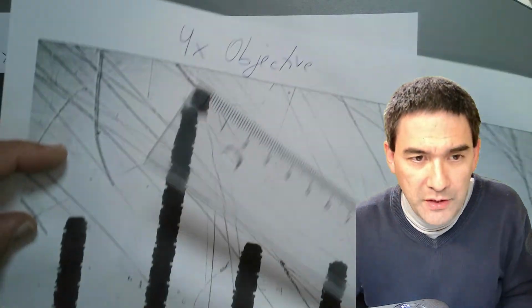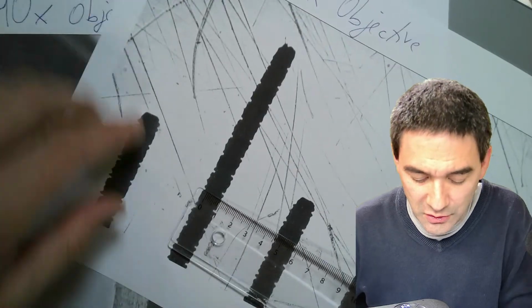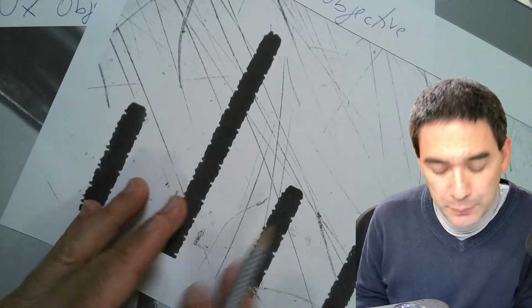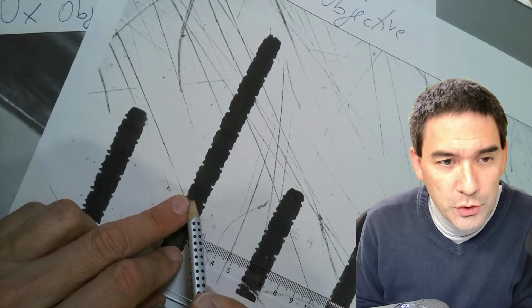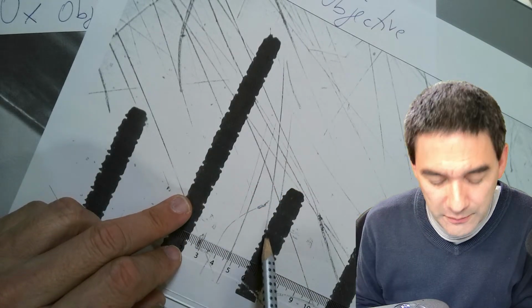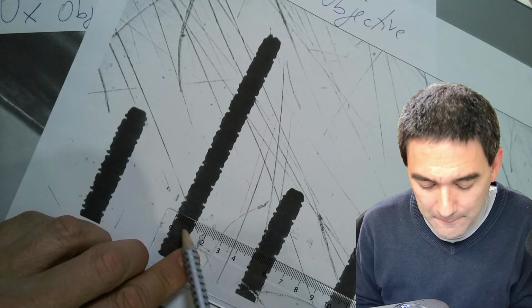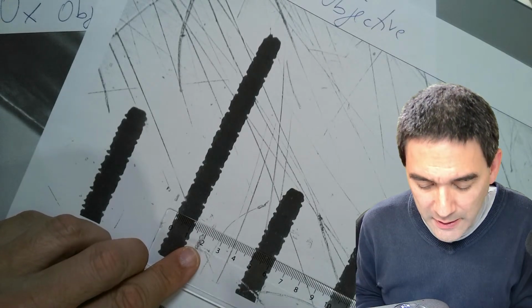And then over here, I do the following. Now the 5.3 can be compared to the 1 millimeter over here. And you see that the lines here are pretty thick. So what I recommend in this case is that you take the left corner here and measure the left corner to the left corner. In this case, it's exactly 50 millimeters. It goes all the way exactly to 50. So that is another value that we have to remember.